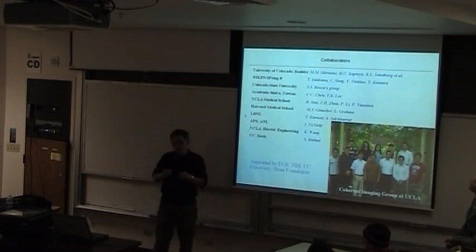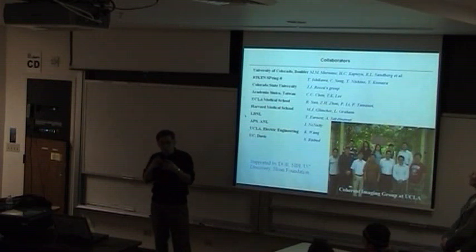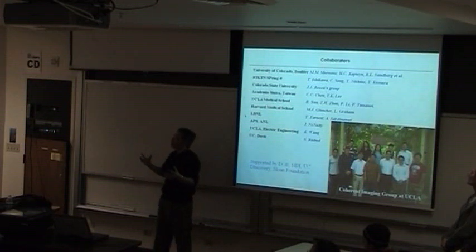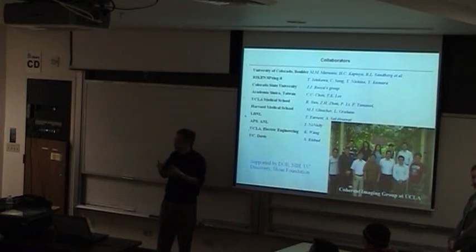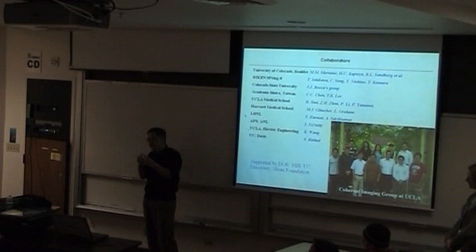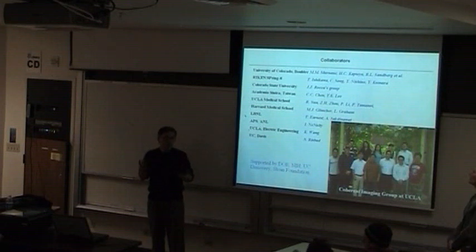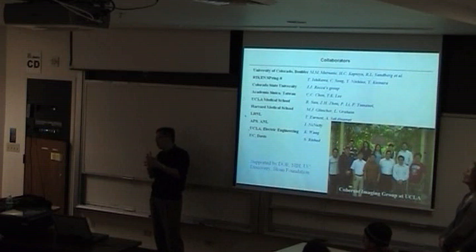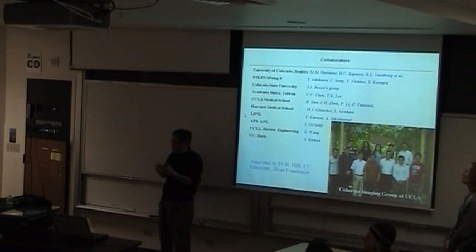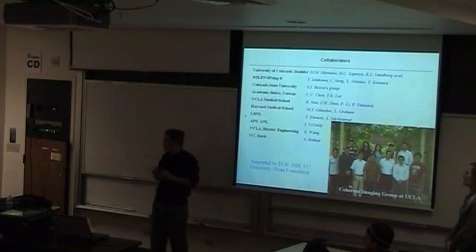The second method, which people still try, is to use very short pulses. With very short pulses, we hopefully can get a diffraction pattern before the sample is destroyed. There's some numerical modeling and preliminary experiments showing that may be the case. If the pulse is short enough, a few femtoseconds, then you can capture the diffraction pattern before the sample is destroyed. So there are two ways. The first way can reduce radiation dose and can study biological cells, but the second method, short pulses, is probably for single molecule imaging.